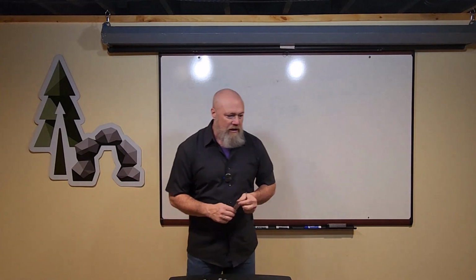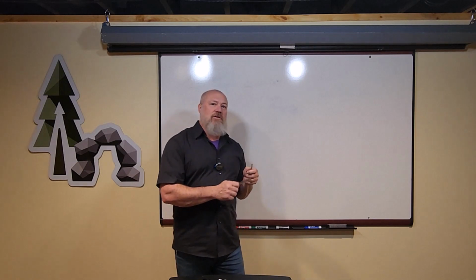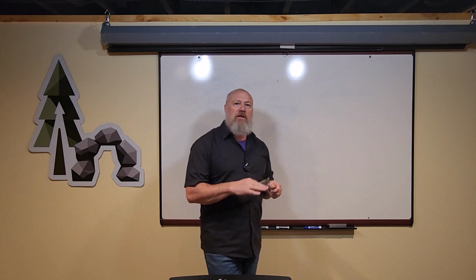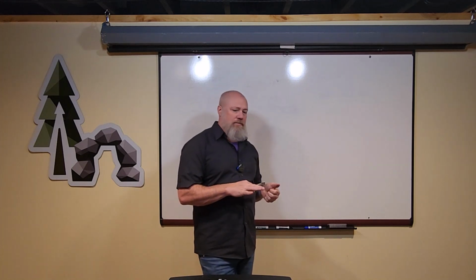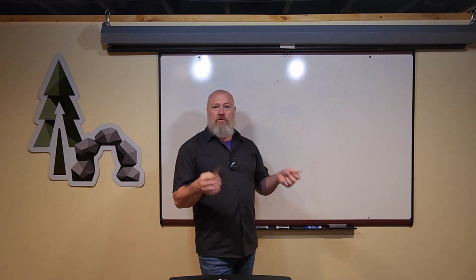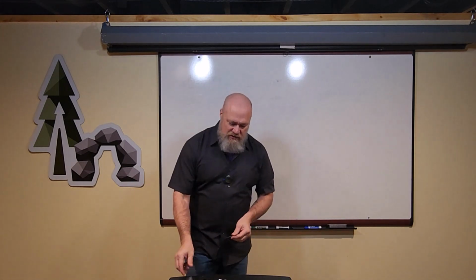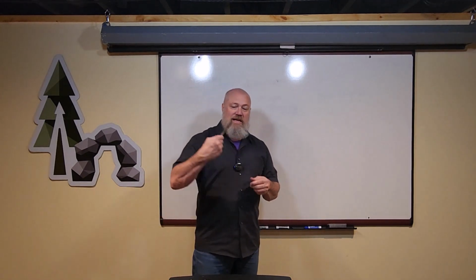Let's be real clear, and I'll say it so many times: the scalpel is only for skin dissection. In the courses I teach, I prefer to use mainly blunt dissection because you don't cut through, transect, or destroy structures before we get a chance to see them. So mostly fingers, blunt probe, and your scissors. And one of the techniques you can use with your scissors is called the scissor technique.